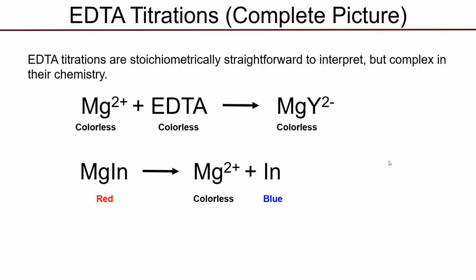Very few real-world laboratory procedures are a step-by-step series of instructions where, as a researcher, you can just step away and say, yep, I'm just going to follow the recipe and I'll get where I want to go in the end. It's what you don't appreciate about the chemistry that can come back to bite you, and so it's essential to understand where the thought process is coming from that led to the procedure that you're using, so that you know and you can guarantee as an analyst that the procedure will work and meet your needs.